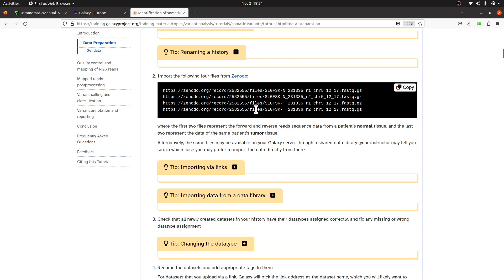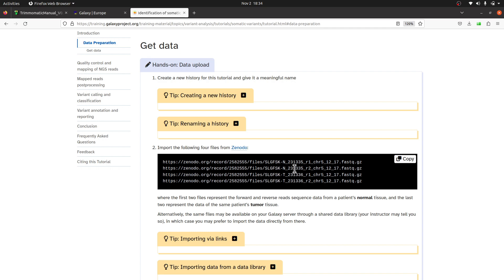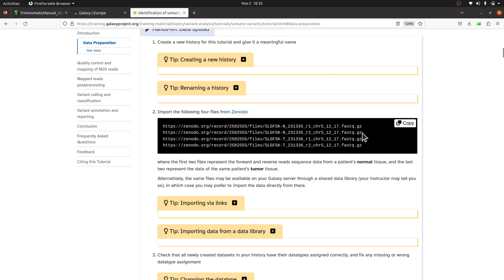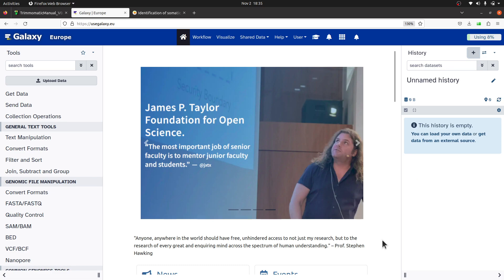I click on data preparation and I have the files here. Because these are paired-end reads, in total we have two samples — sample one and sample two. I'm going to use the first sample; you can also try with the second. The instructions for trimming can also be found on the same page if you scroll down. Now I want to import the data, so I'll copy these two file links.